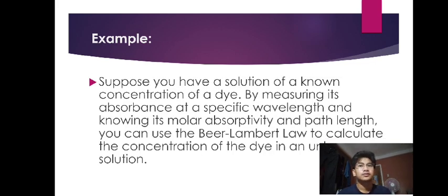For example, suppose you have a solution of a known concentration of a dye. By measuring its absorbance at a specific wavelength and knowing its molar absorptivity and path length, you can use the Beer-Lambert law to calculate the concentration of the dye in an unknown solution.